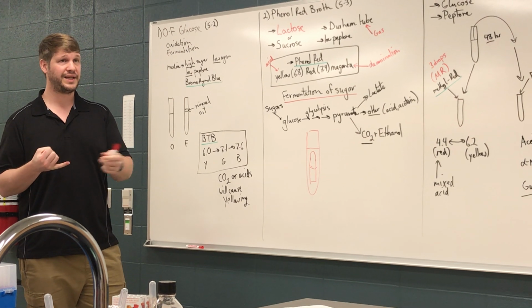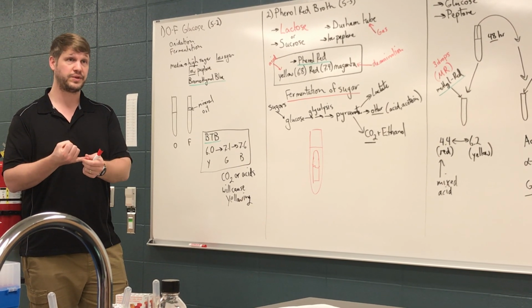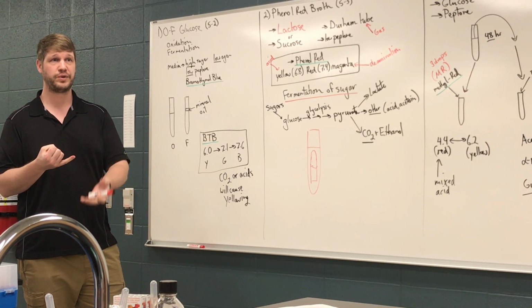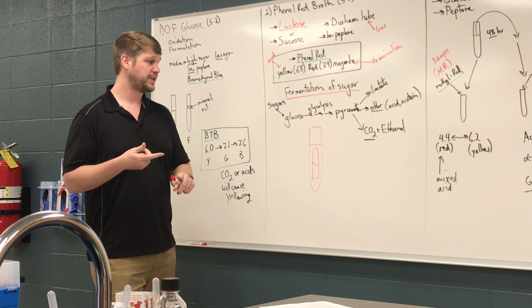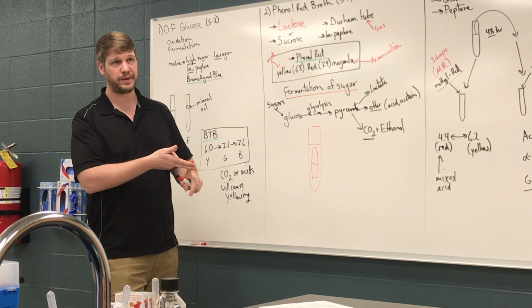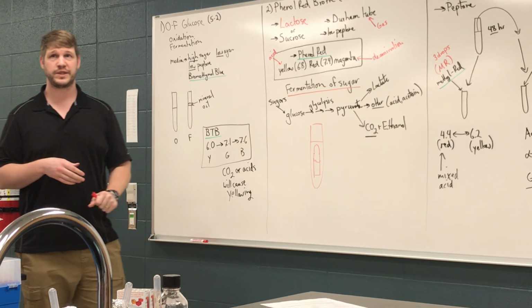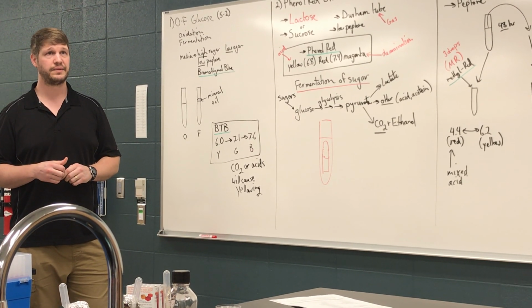Like with cysteine, if you were removing the sulfhydryl group, you could in theory produce hydrogen sulfide, but there wouldn't be enough produced to see. Other microbes will produce hydrogen gas or methane, but that's typically in an anaerobic context, and these are not anaerobic. So CO2 is basically what we're seeing if we see gas being accumulated.